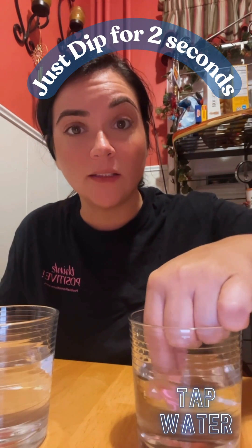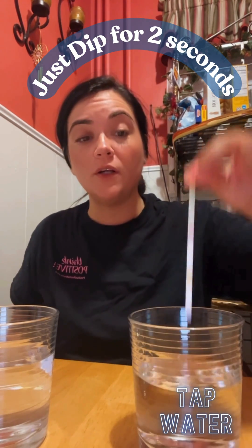Now we're going to do a test strip in the tap water. Just like before, you dip for two seconds — one, two — make sure the whole strip is submerged, then wait a few seconds. You can already see the colors changing. This is crazy guys — remember, this is the tap water, so let's see.